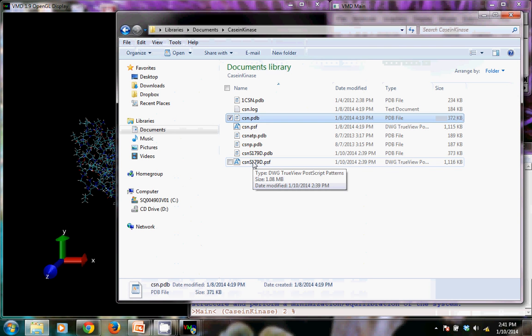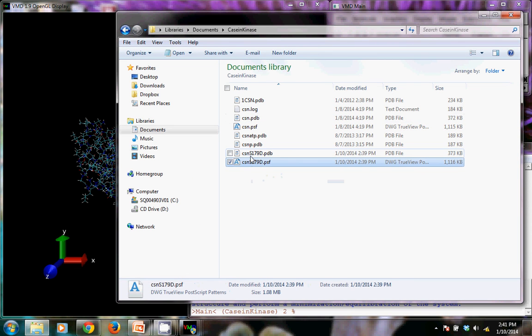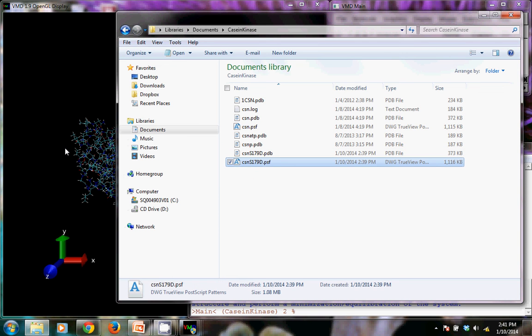It is possible, if you would like to, to start with this mutated PDB and protein structure file, you can load those into VMD. And you could do a second mutation. And you could continue that and make as many mutations as you like. It's just an iterative process where you have to start with the wild type and perform one mutation at a time.